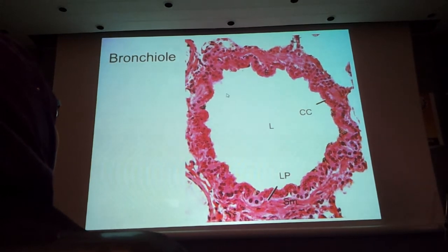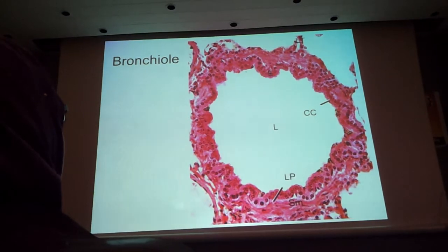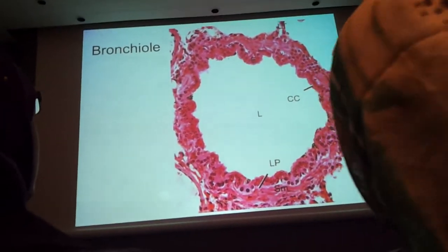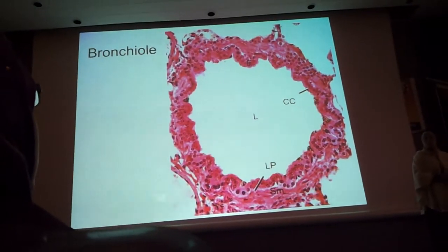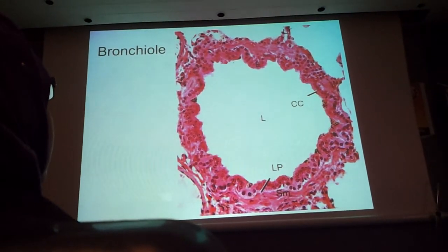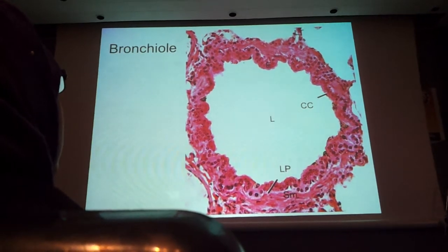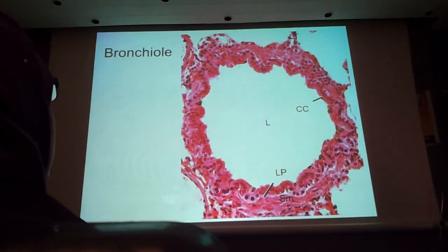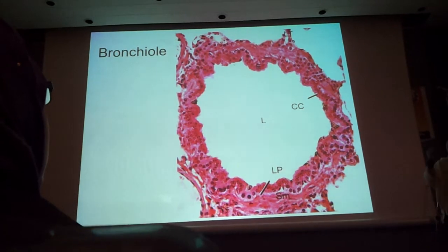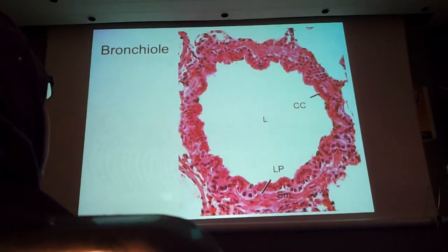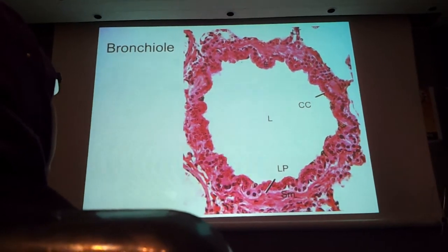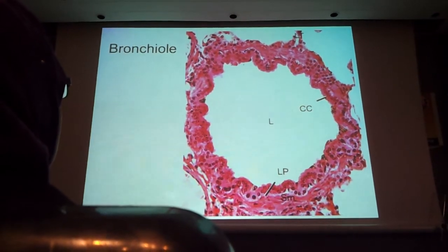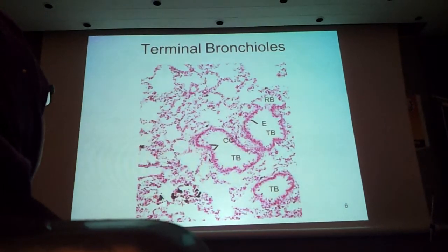Regarding the bronchioles: the largest, more proximal bronchioles would have ciliated columnar epithelium with cilia. But as you go distally, it is replaced by ciliated cuboidal epithelium. More proximal and larger bronchioles may have occasional goblet cells, which are unique to respiratory epithelium. But in the most distal bronchioles, you can see Clara cells instead. Clara cells are just columnar cells that don't have cilia.